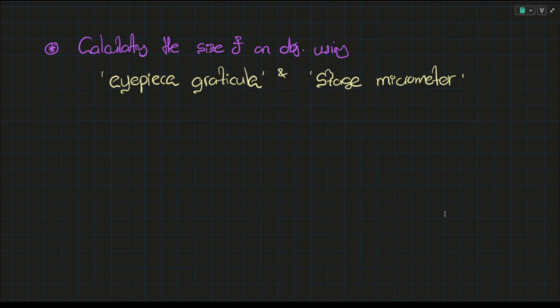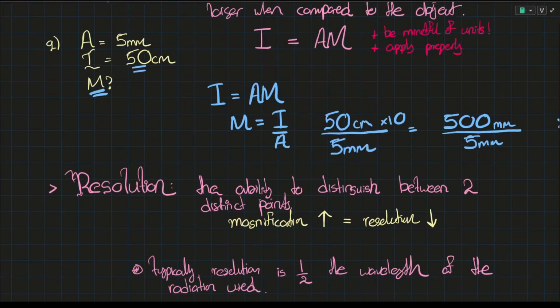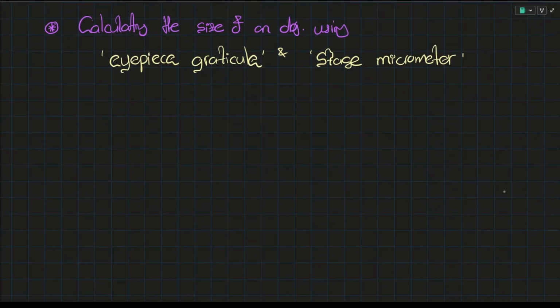Now, in the world of microscopy, everything's tiny. The microscope has a stage, and it has specific parts as well. I'm not going into that much detail yet. You don't have to know about that yet. We'll talk about that in the practical part. When it comes to the stage, we typically place something known as a micrometer on that stage. That's why we refer to it as a stage micrometer. It has these fine lines like divisions.